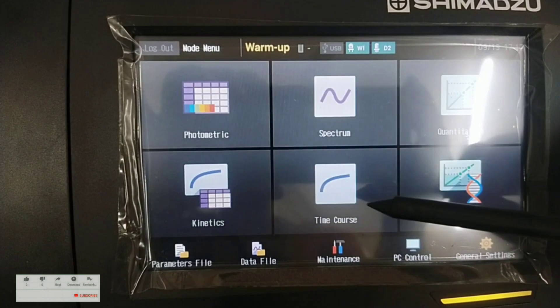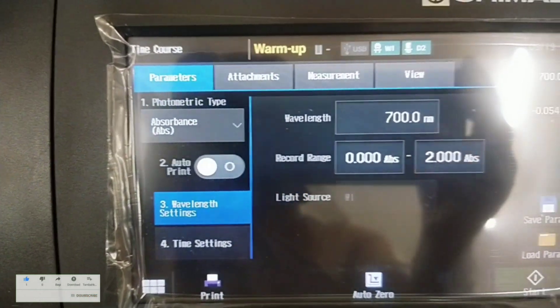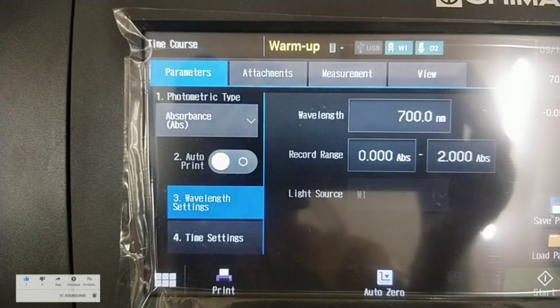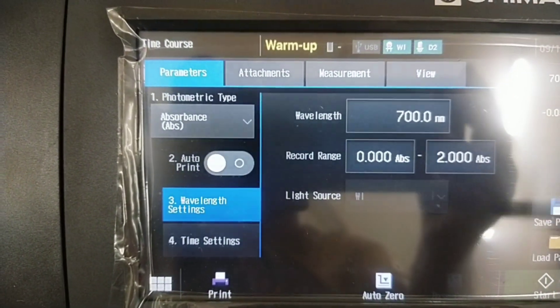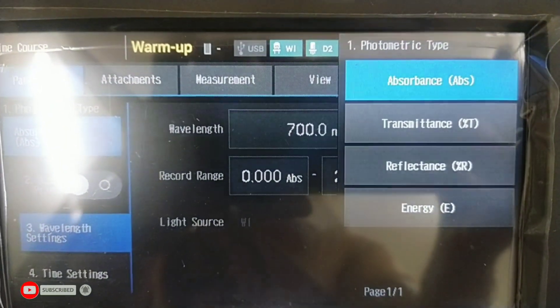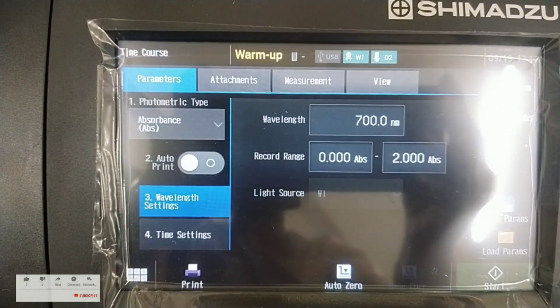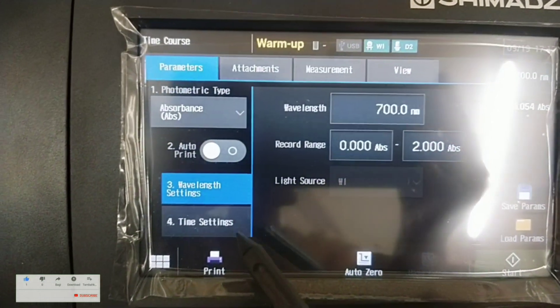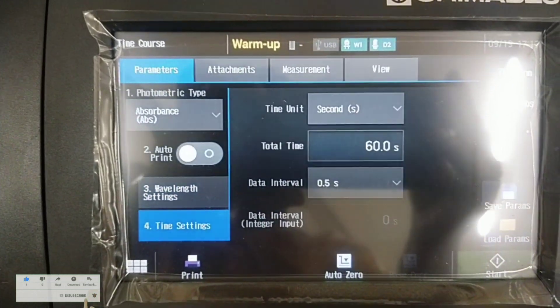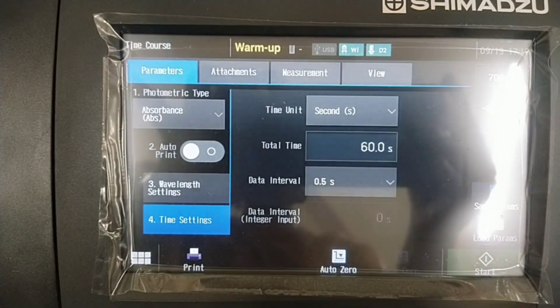Time course or time scan mode is used to measure the absorbance changes as a function of time. Measurement modes are absorbance, percentage transmittance, and energy. Carefully observe the settings.